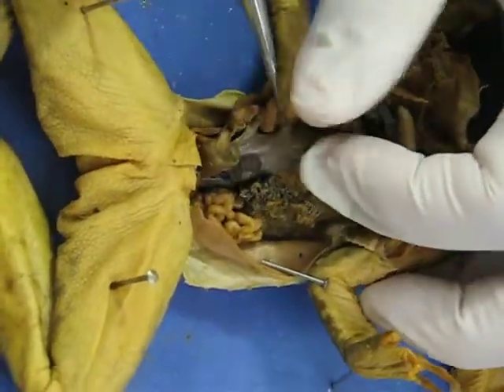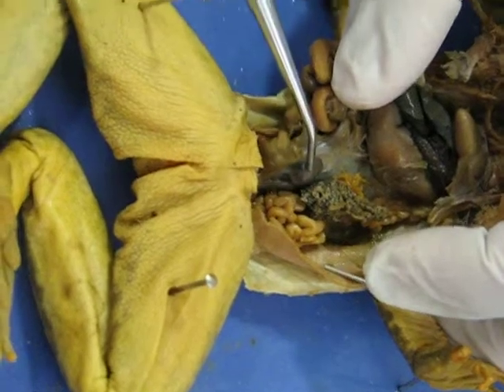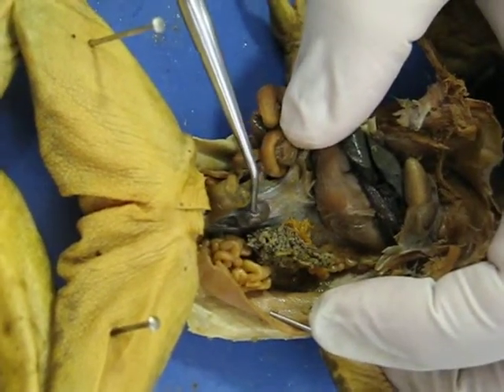If you pull all of that back, there's another ball underneath. And that ball right there is the spleen.